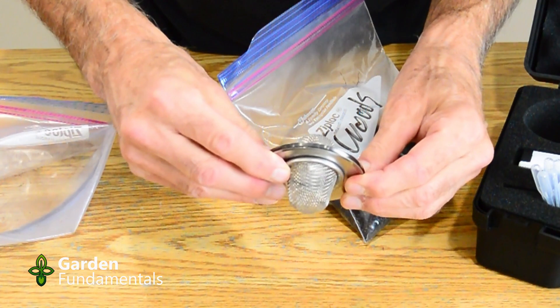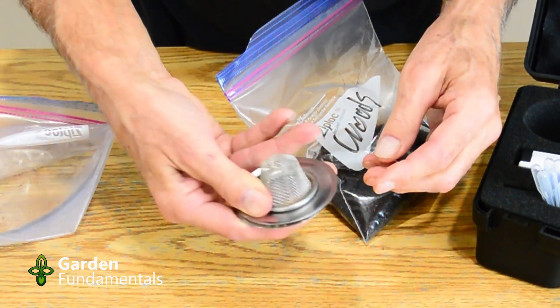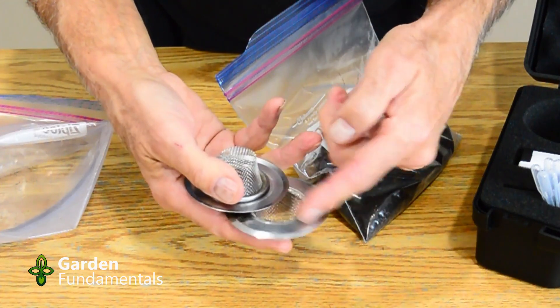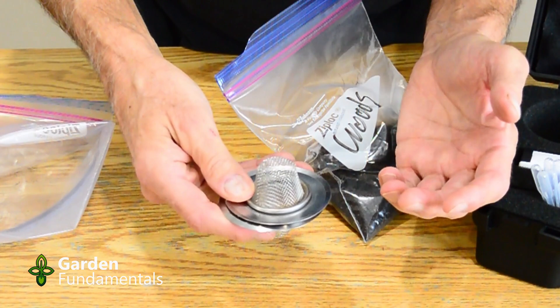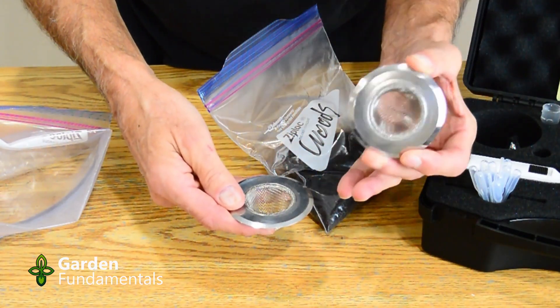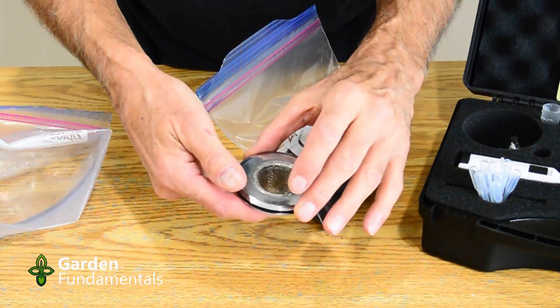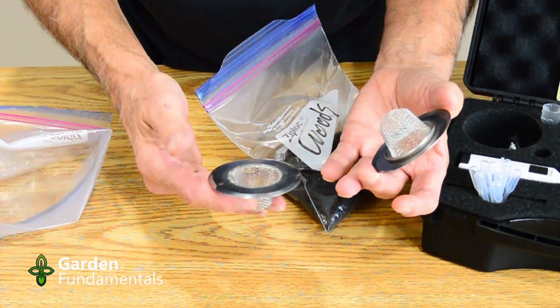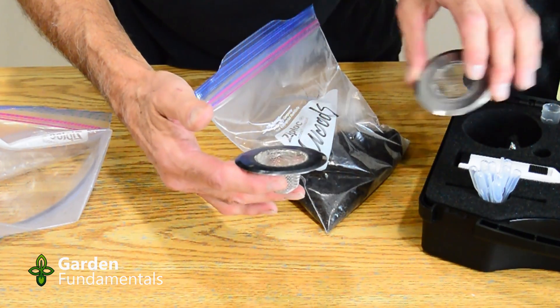There are actually two sieves, and the instruction videos show you that you put soil in one side, put the lid on, hold them together, and shake. The sieves make sure that only small particles of soil come through. The problem is these sieves don't work very well — they don't actually fit together, so you can't hold them with one hand. What I found was when I tried to sieve them, the bigger material would come sliding out between the two sieves. It was also suggested that you could put soil on one side, turn the other over and press it through. Tried that — that didn't work very well either. But I did find a way to use these sieves that works quite well.